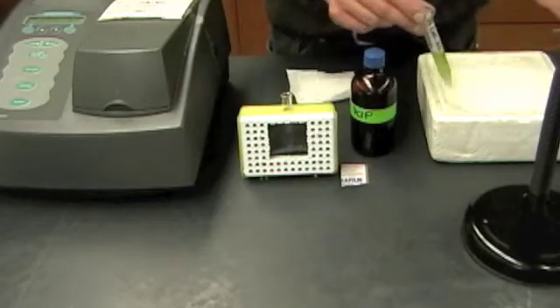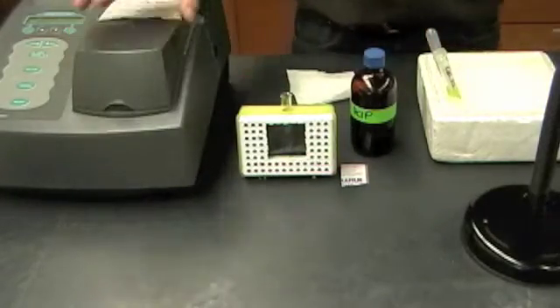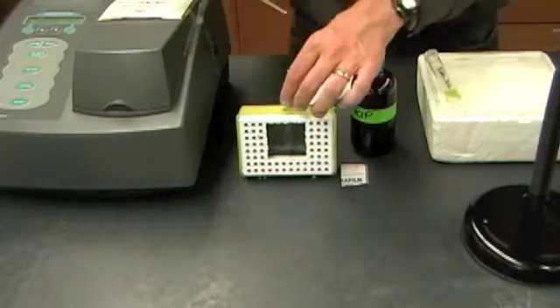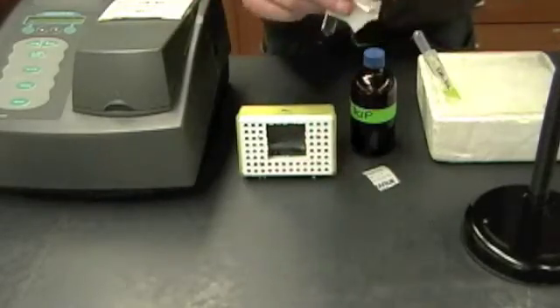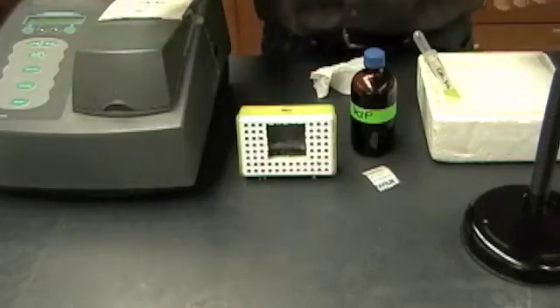The last thing I've got is my chloroplast dilution ready to go. So now that everything's set, I can take my blank out. I'm going to add a half a mil of my chloroplast dilution to this, quickly wipe it off, and get my initial spectrophotometer reading.